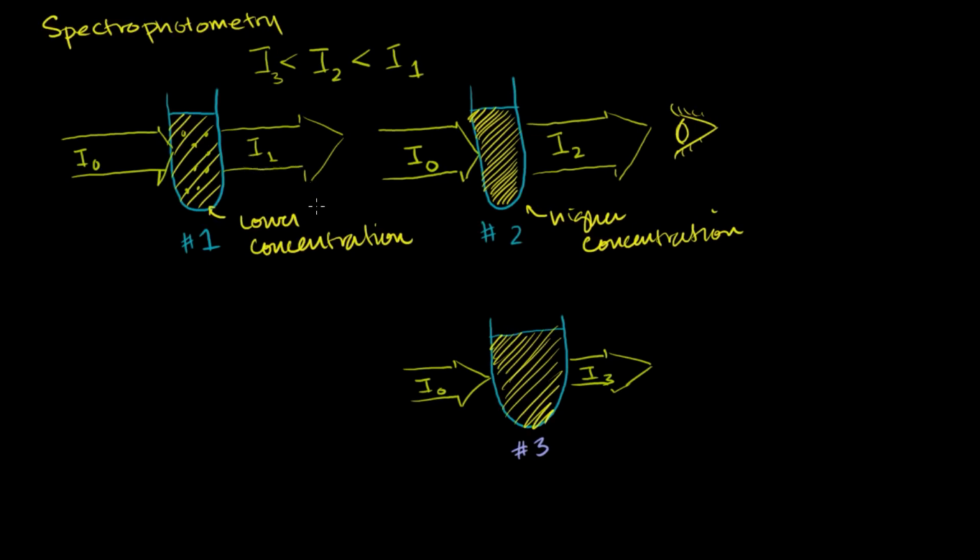And so the next question is, well, what is it even good for? Why would I even care? Well, you could actually use this information. You could see how much light is transmitted versus how much you put in to actually figure out the concentration of a solution. That's why we're even talking about it in a chemistry context.